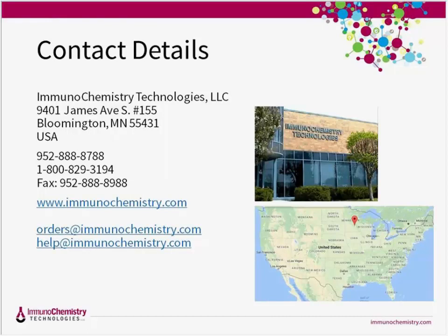As far as neutralizing or deactivating trypsin, with most commercially available trypsin products, this is a necessary step as it prevents the trypsin from going beyond just breaking down these cell adhesion proteins to actually cleaving cellular surface proteins as well, which of course would result in cellular damage. So for this purpose, we normally recommend using fetal bovine serum or cell culture medium containing at least 20% FBS, as serum does naturally contain trypsin inhibitors that can neutralize or deactivate the trypsin.